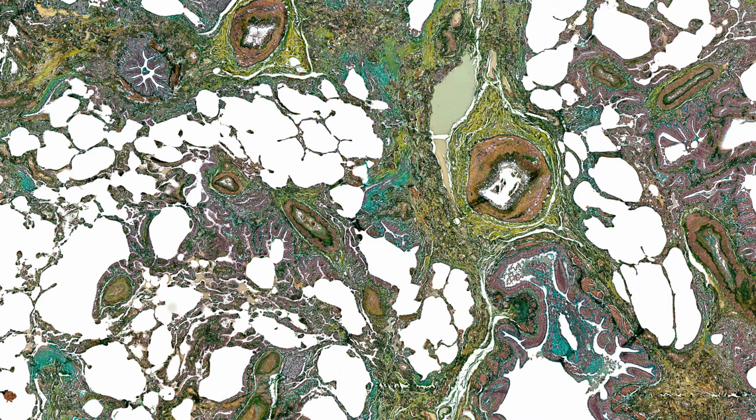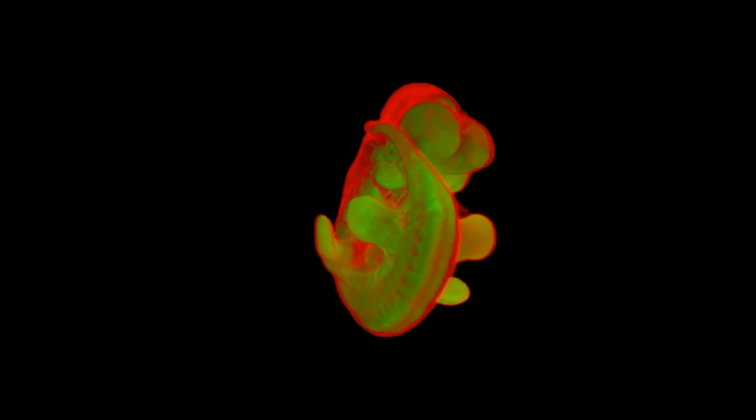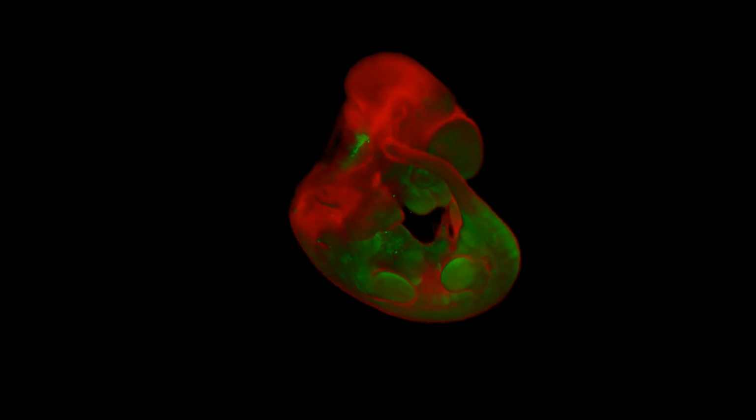The third problem is that we are only ever looking at a very small region of our specimen. What if the feature of interest isn't in that region? We've missed it. And critically, biology doesn't occur in 2 dimensions, it occurs in 3 dimensions. So looking at it in only 2 dimensions means you're not getting a full view of how things relate to each other.